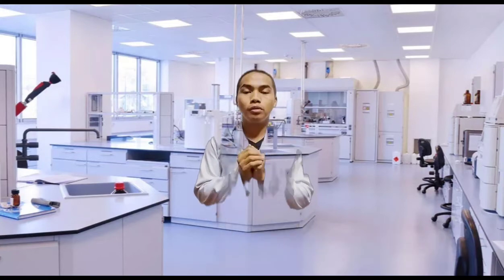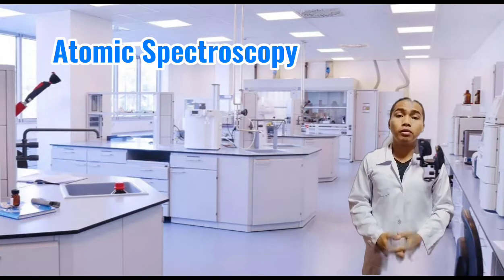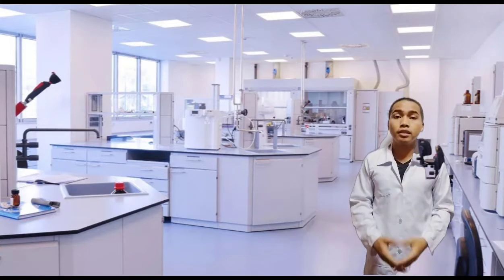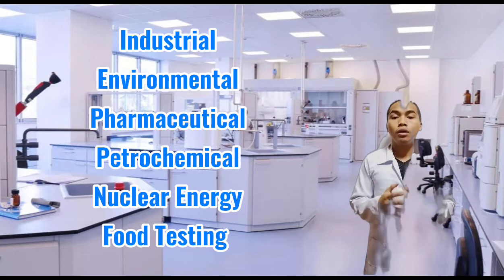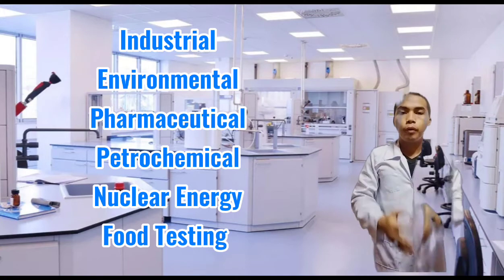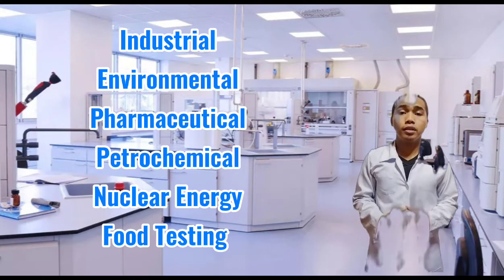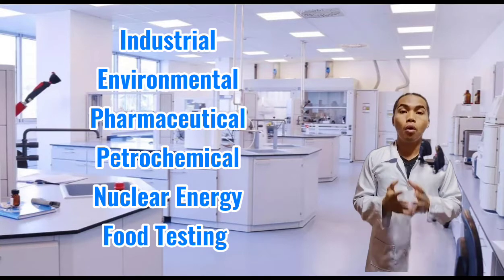Good day everyone, my name is Michael Martinez and today we are going to discuss the application of atomic spectroscopy and the instrument used in atomic spectroscopy. Atomic absorption or atomic emission spectrometers have been used in many different industrial, environmental, pharmaceutical, petrochemical, nuclear energy, food testing, and academic settings. For example, a medical laboratory could detect the type and amount of toxic metals that could be present in patient urine or blood.